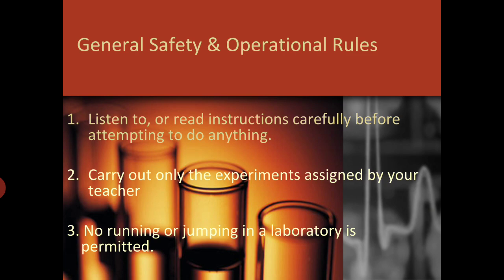Coming to the rules, the first one is listen or read the instructions carefully before attempting to do anything in the lab. Carry out only those experiments which are assigned to you by your teacher. No running or jumping in laboratory is permitted.